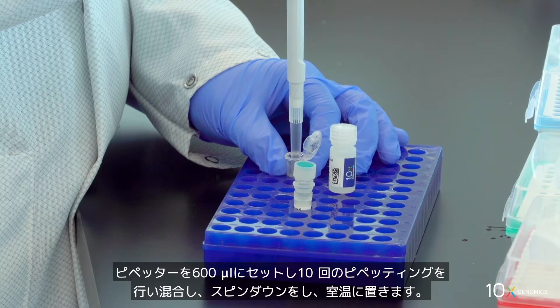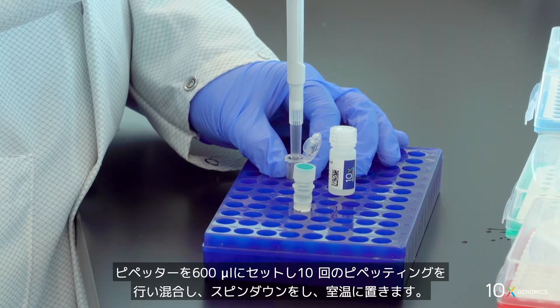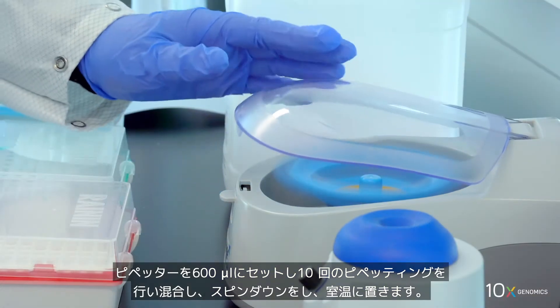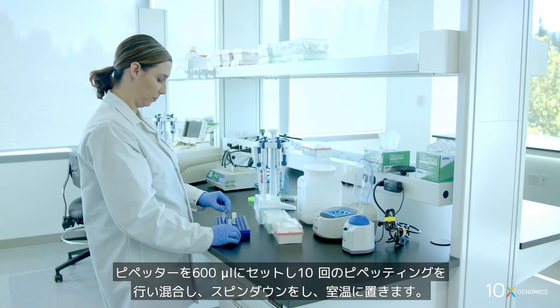Pipette mix 10 times with the pipette set to 600 microliters, spin down briefly, and maintain at room temperature.